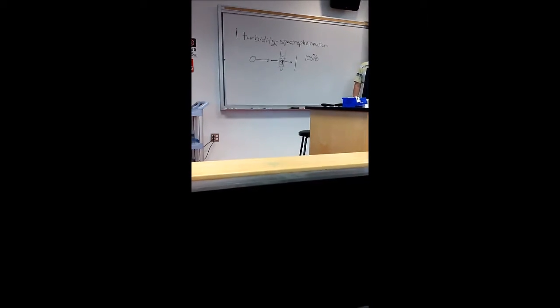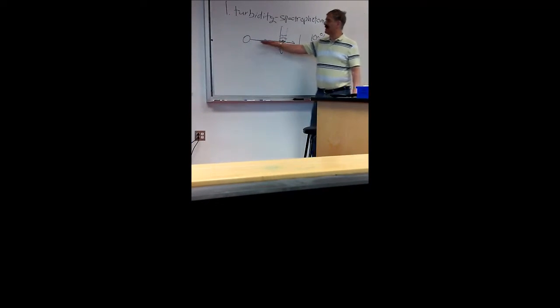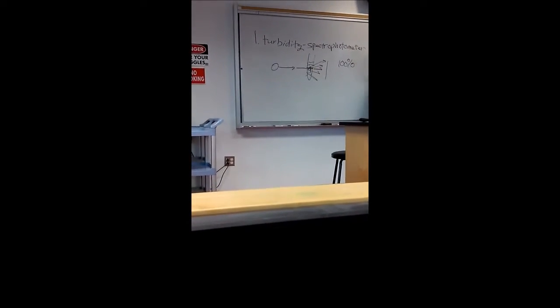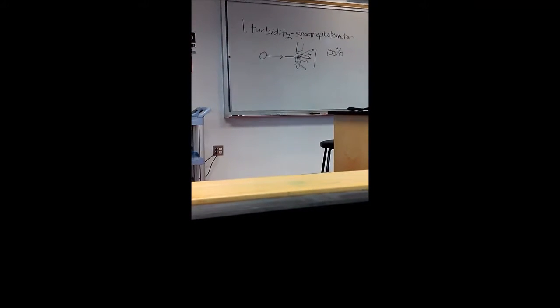So it gets all cloudy in there with the growth. Again, it could have been DNA or proteins, could be the bacteria. It gets all cloudy. So now when you shine the beam it is going to hit all these particles. And the light scatters. The light bounces off all those particles. It's called the Tyndall effect.